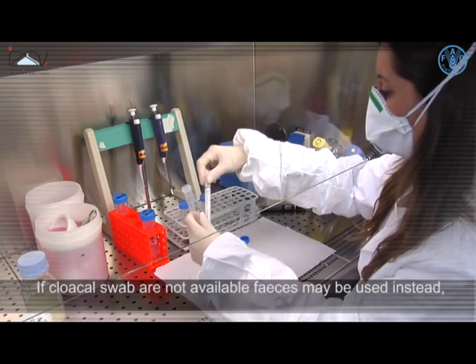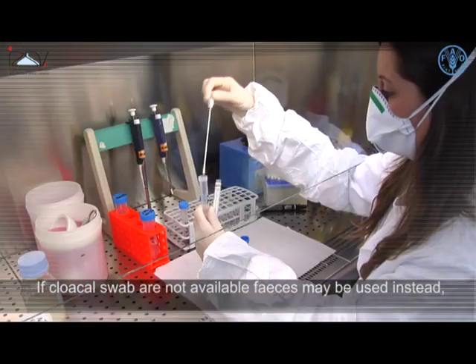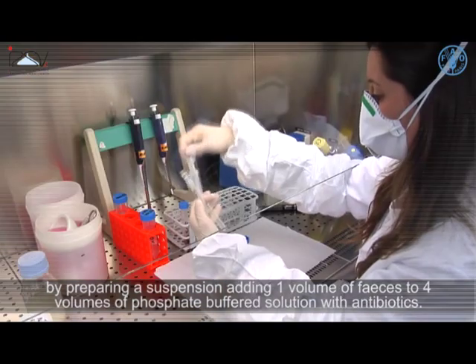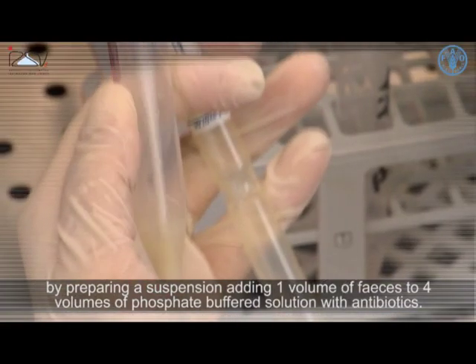If cloacal swabs are not available, feces may be used instead, by preparing a suspension adding 1 volume of feces to 4 volumes of phosphate buffered solution with antibiotics.